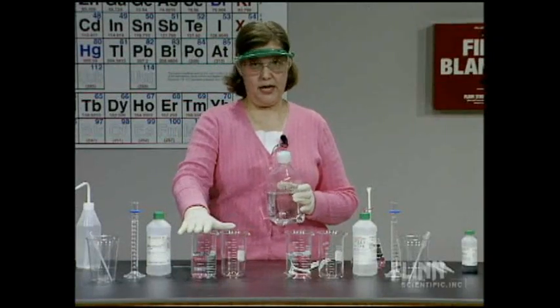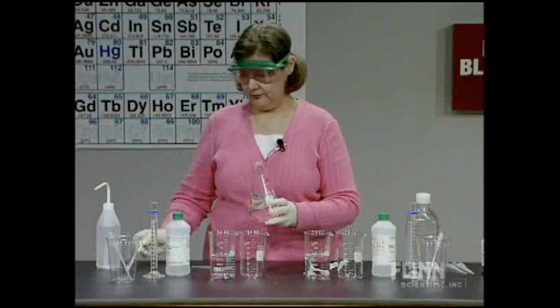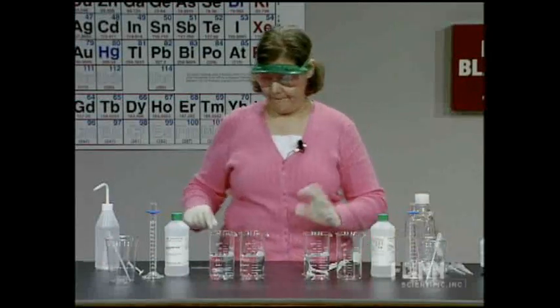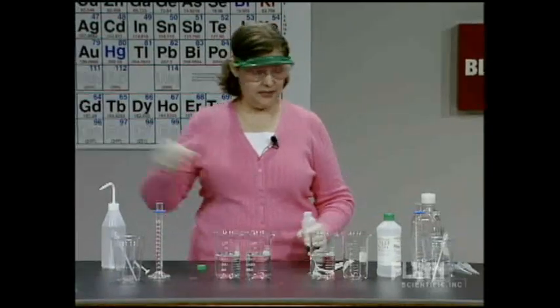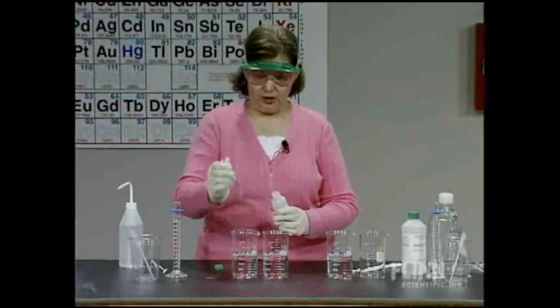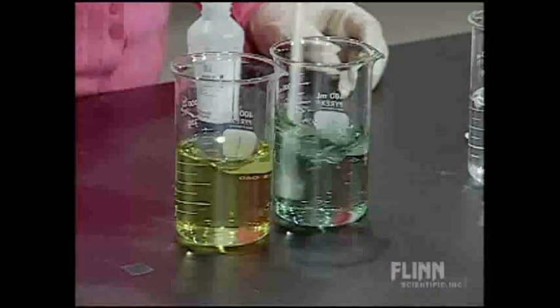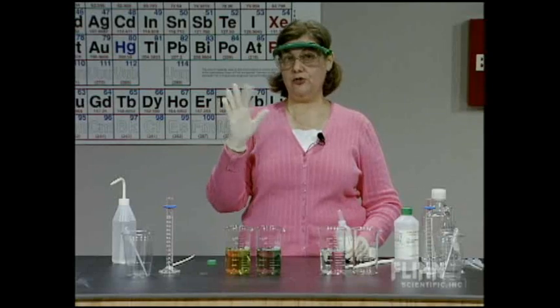Let's focus on beakers one and two. Distilled water goes in beaker one, and my freshly made buffer goes in beaker two — equal amounts, about 200 milliliters each. Now I want to observe the effect of acid and base on pH, so I need to add some indicator. I'm adding bromthymol blue indicator to both the distilled water and the buffer.